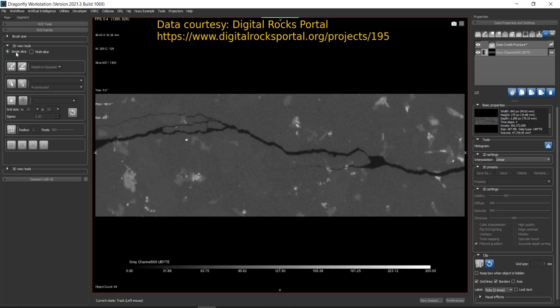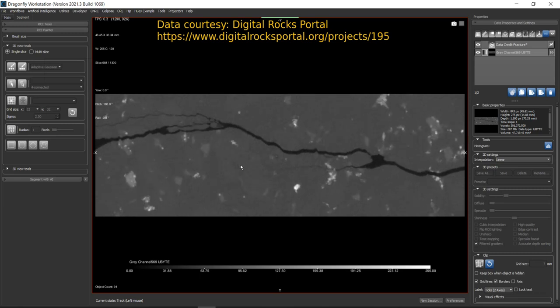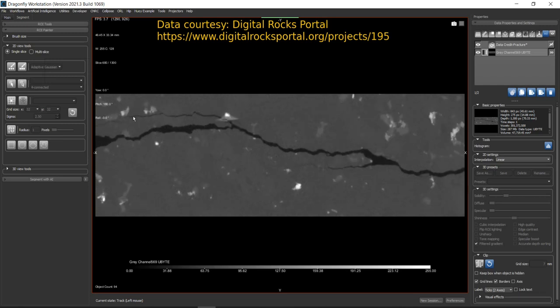Under 2D View Tools you will see two options: Single Slice and Multi Slice. Single Slice allows you to paint on the current slice only. Multi Slice, on the other hand, lets you paint on multiple slices that extend through the volume based on the size of the brush you choose.